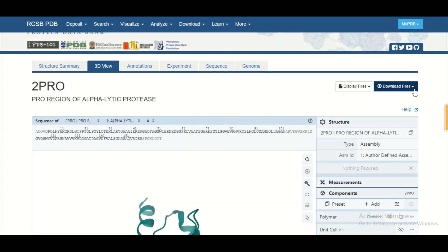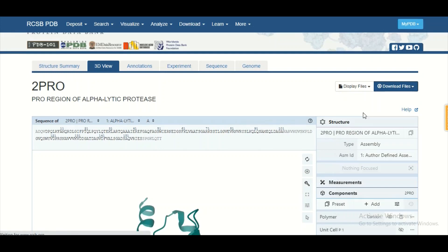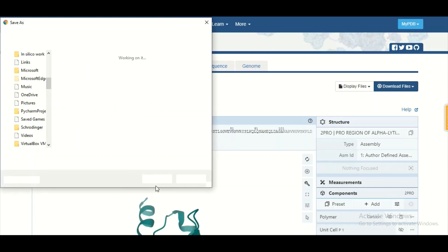We will talk about protein visualization in detail later on. To download the protein structure to your machine, click on the download files button. When the dropdown menu opens, click on the PDB format and the protein structure will be downloaded. You can then open it in software installed on your system.